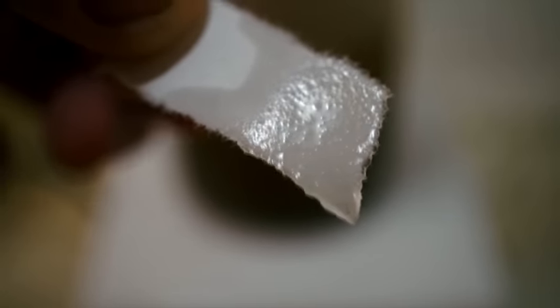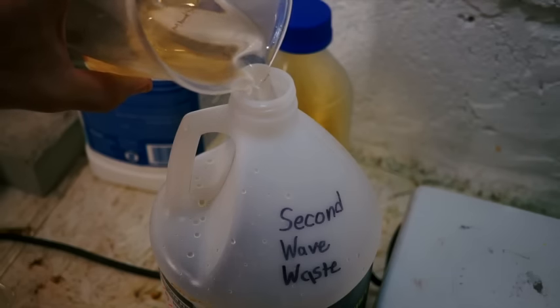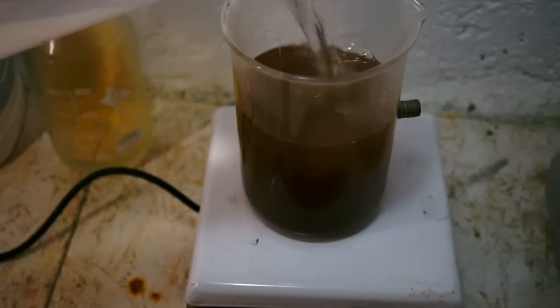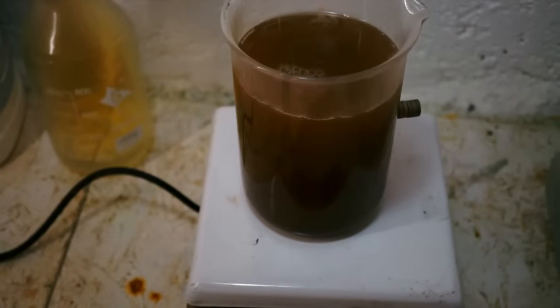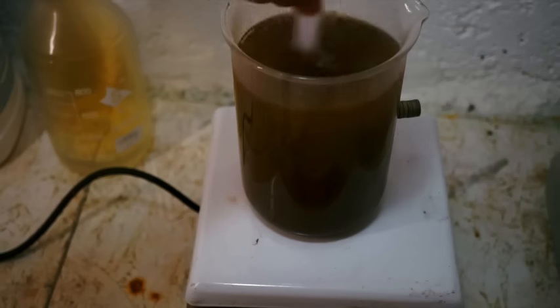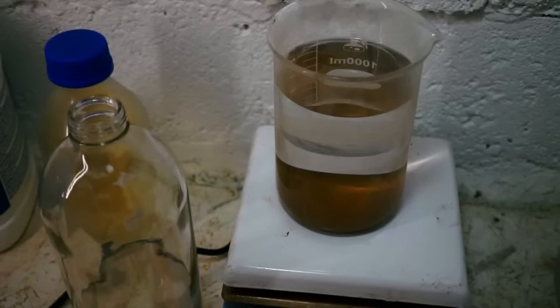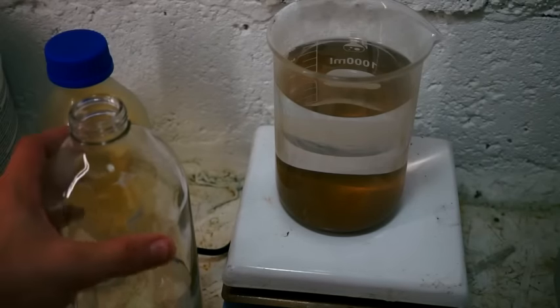A quick stannous chloride test reveals there is no more gold dissolved in solution. After allowing the gold to settle, you can see that this rinse is very clear. Pour this off into second round waste for further treatment at a later time. Rinse the gold powder with hot water. Once the gold has settled, pour off and dispose of your rinse water.